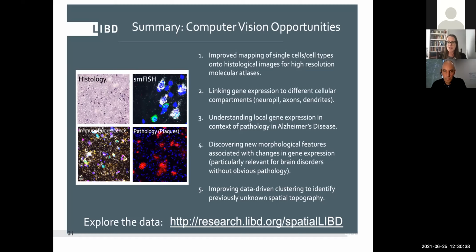Yeah, I mean, that's a good question. So right, by the time you have some kind of pathology, you already have probably pretty dramatic changes in RNA expression. So one particularly interesting application of something like the Visium-IF is can you do this earlier, before you actually have a pathological burden, and start to predict who may or may not progress to that kind of burden. But I think because it's only become so new that we can do the molecular profiling and the pathological profiling at a genome-wide scale, I think that remains to be seen. I think some of these challenges.